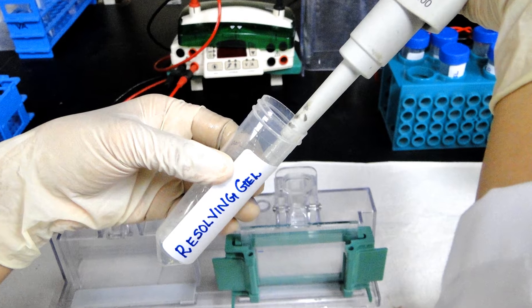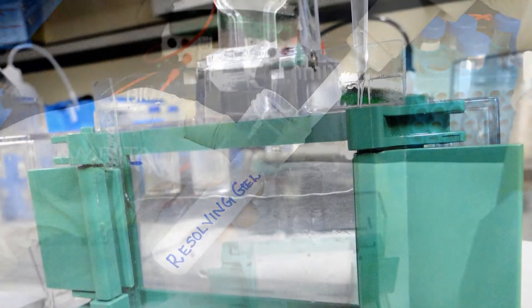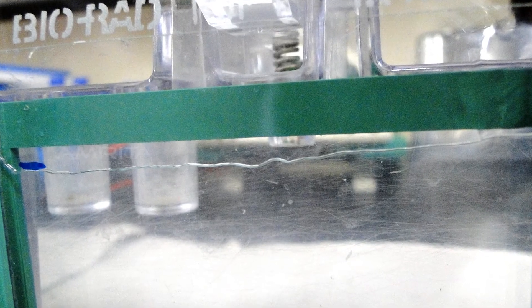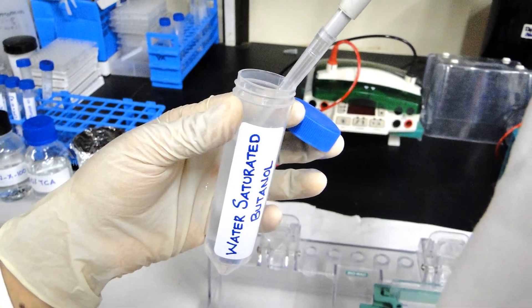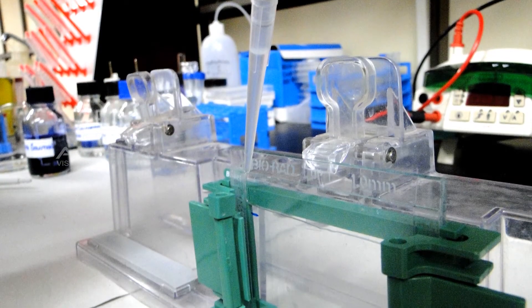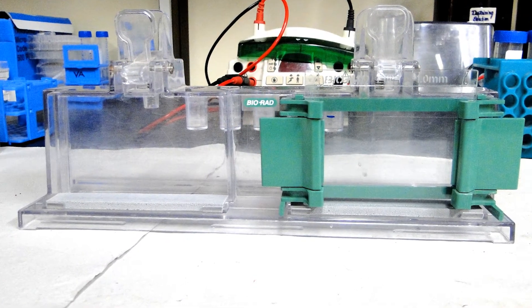Once the TEMED is added to the mix, immediately pour the resolving gel into the glass plates up to the mark drawn. Pour 1 ml of water-saturated butanol above the resolving gel layer. Allow the gel to polymerize for 20 to 30 minutes.